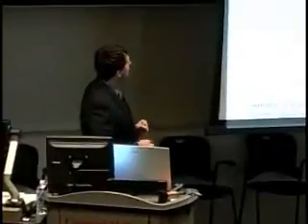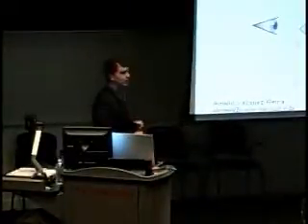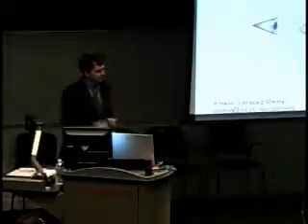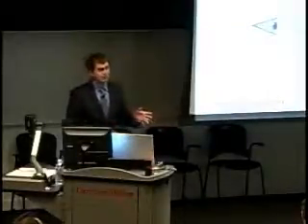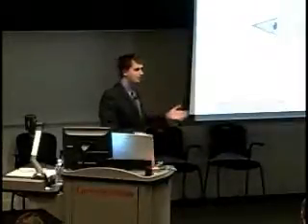The first one is the pre-visualization of the data for the selection of region of interest. So one of the most important features of the pre-visualization of the data is the ability to do on-demand volume rendering of the data. And the goal here is to avoid any pre-processing or any generation of extra information during the raycasting. So we can achieve this if we, for example, process only those data blocks that are visible to the user at any point, and also if we take advantage of GPU caching schemes so that we can quickly recall those data blocks that have been already processed in some previous interaction.